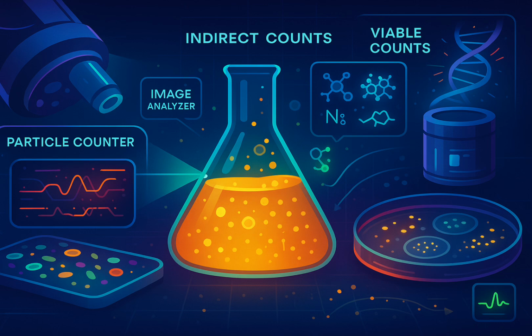Okay, and now the one everyone thinks of. Dilution plate methods. Pour plates, spread plates. The absolute classic. Yeah. Serially dilute your sample in a suitable liquid that keeps the cells alive but doesn't let them grow. Sterile saline or buffer, usually. Then take a small, known volume of a dilution and put it on or in an agar plate. Spread plate: pipette onto solid agar, spread it evenly. Pour plate: mix with melted, cooled agar, pour into the dish, let it set.